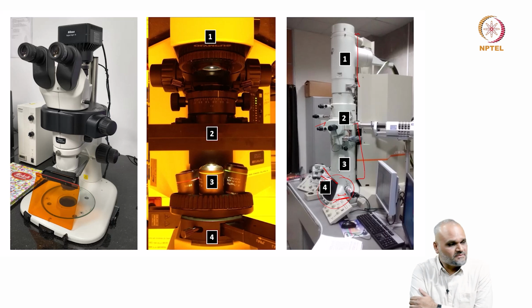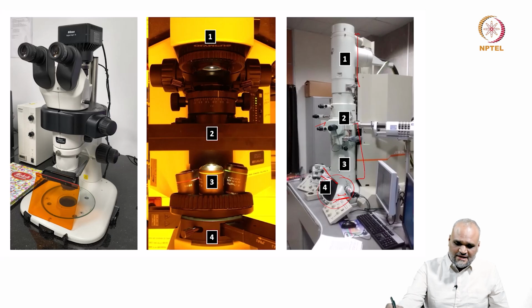So having said that, what can you use these microscopes for? If you look at it, one main difference in the construction of an optical microscope to an electron microscope is, you see these large columnar structures. Why do we have this column? And what kind of a lens is used in here? And what do we see here? What are these detectors? What is the functionality of all of them is what we'll see through the next lectures in this particular course.